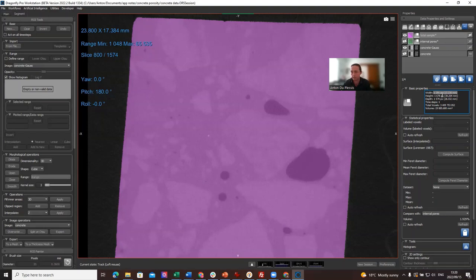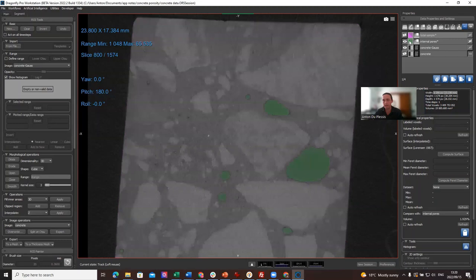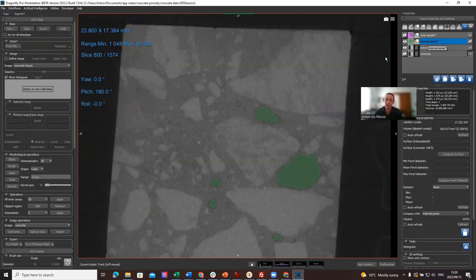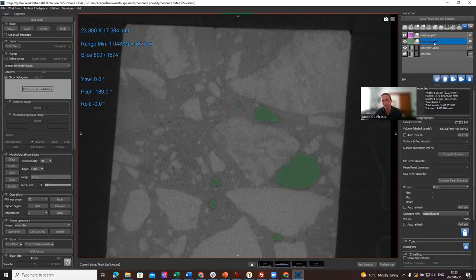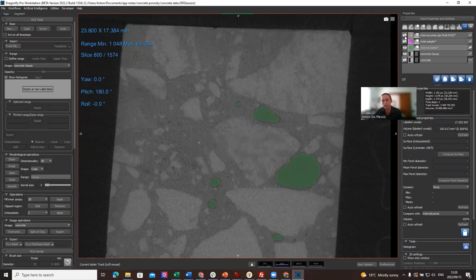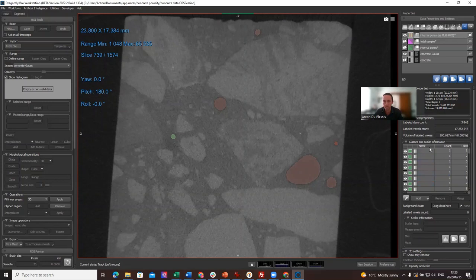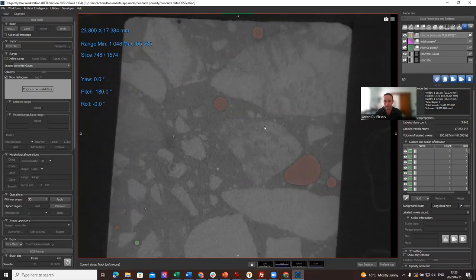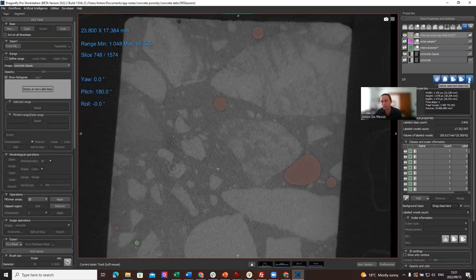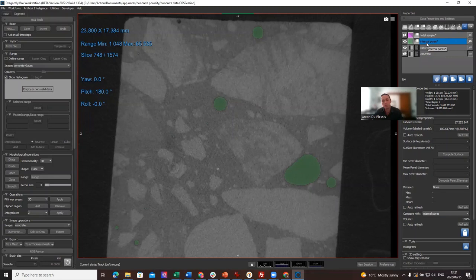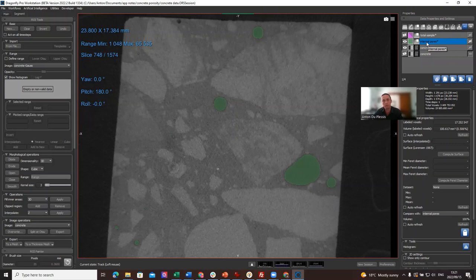So the next step is to make a deeper analysis of this porosity. We want to calculate values for each pore space separately, so we need to create a multi-ROI. But something I should have done—let me take one step back. The internal pores are now including even pores with only one voxel, which is most likely noise. So depending on the scan quality, a good rule of thumb is to remove pores smaller than 3x3x3 pixels, because having less than 3 pixels in one dimension across a feature is not a reliable way of quantifying pores. More on that topic another day.